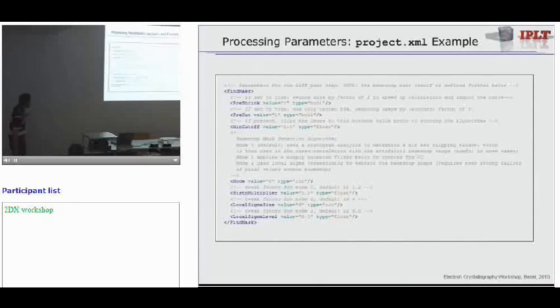So that's just a small example of how the data file actually looks like. That part is for finding the mask. So there are several things you can tweak on how the mask is found. So if you work on a shrunk image or on the full-sized image, if you want to clip first your diffraction pattern to exclude some very high or some very low values, because sometimes you get just some noise data in there.